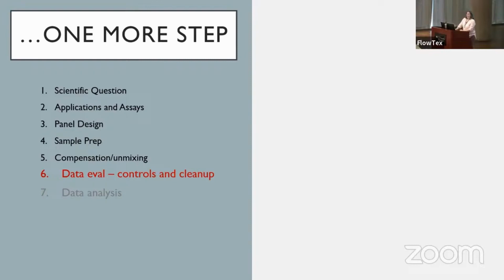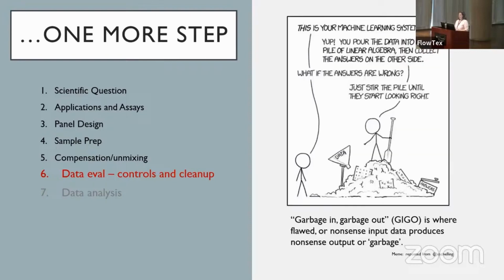So I think he talked about bias, and so basically the accuracy and the precision of your data. And what we'd like to do is get to a point where we can feel confident that we got to that point. So I believe it was Sarah that mentioned earlier today, garbage in, garbage out. So it wouldn't be a talk without pulling in an internet meme.